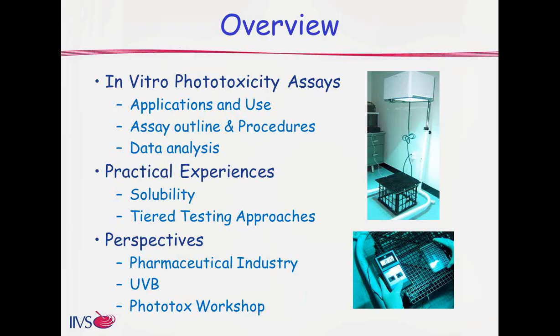Thank you, Mandy. Good morning, everyone, and welcome to our webinar on phototoxicity. We're going to start our webinar with an overview of the 3T3 neutral red uptake phototoxicity and the three-dimensional reconstructed human epidermis in vitro assays. We'll start with a brief outline of these assays, highlighting their application and use, procedures, and data analyses. I'm not going to spend a whole lot of time discussing specific details, as these assays have been around for a number of years, and many of you may already be familiar with them. However, we will have a Q&A session at the end of the webinar to address specific questions you may have.